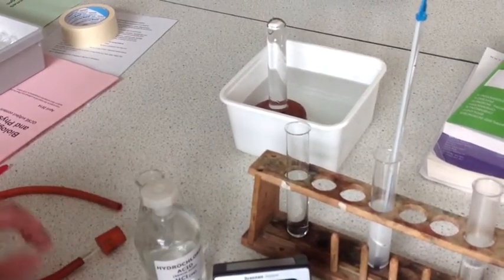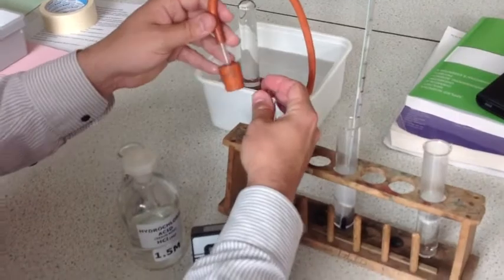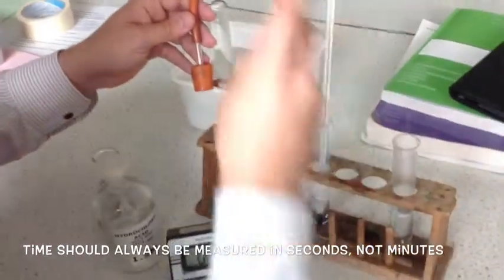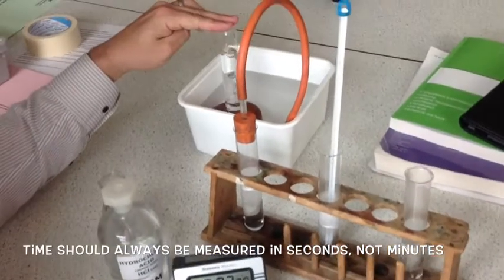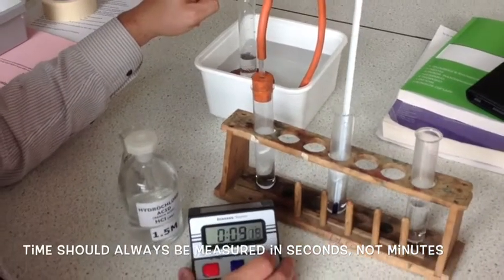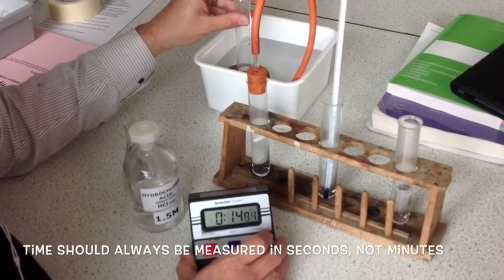As I said, I can also record time. So usually when we record time, it's time to do something. In this case, I'm going to look at the time to produce a certain amount of gas, or a test tube full of gas. So similar experiment, add the magnesium to the acid, put the tube in, start the timer, and you can see the hydrogen gas being collected here. And you'll stop the timer again when it's completely full of gas.